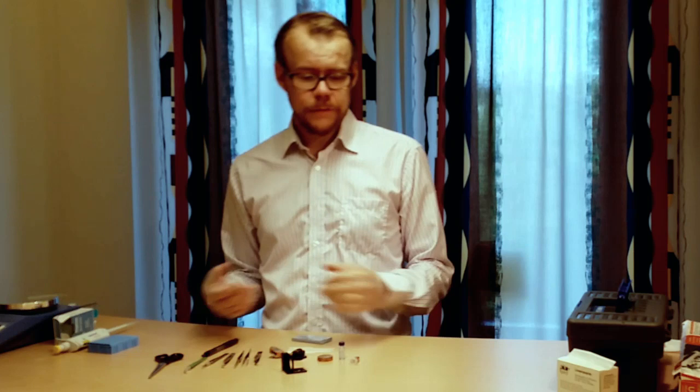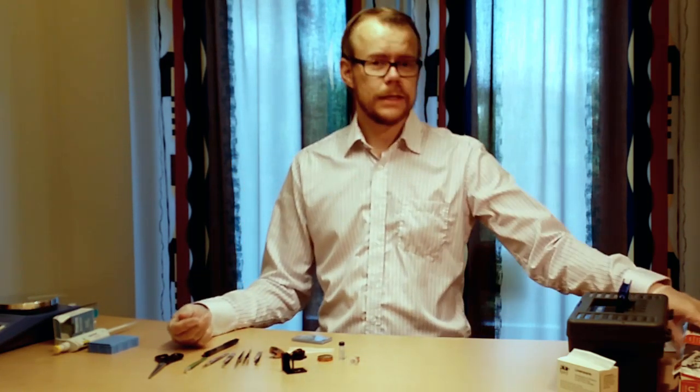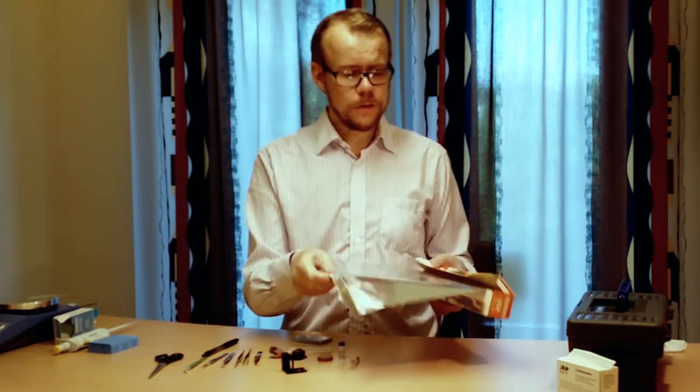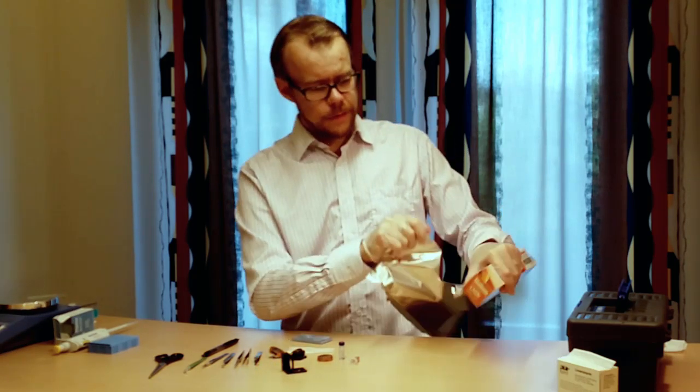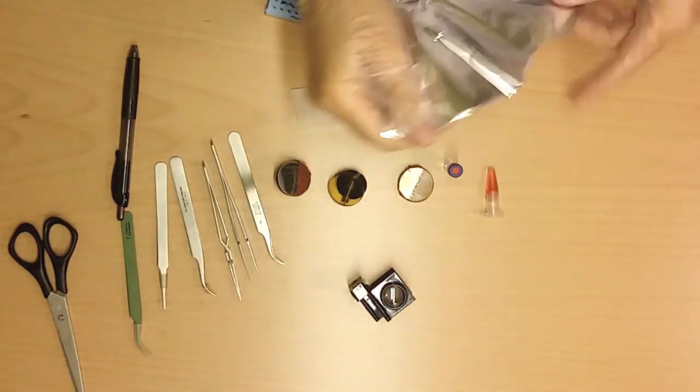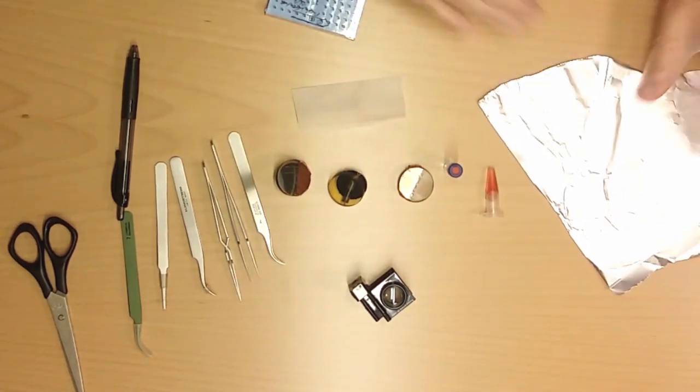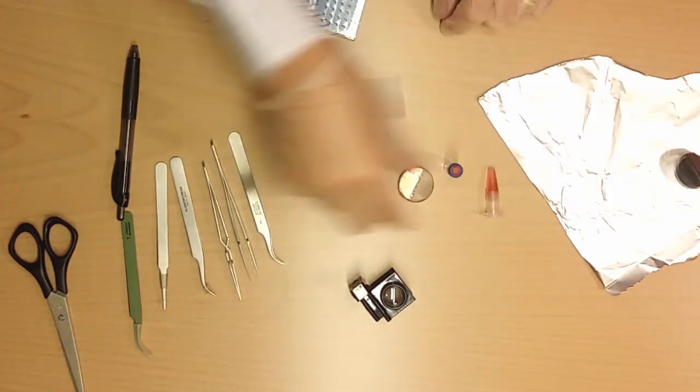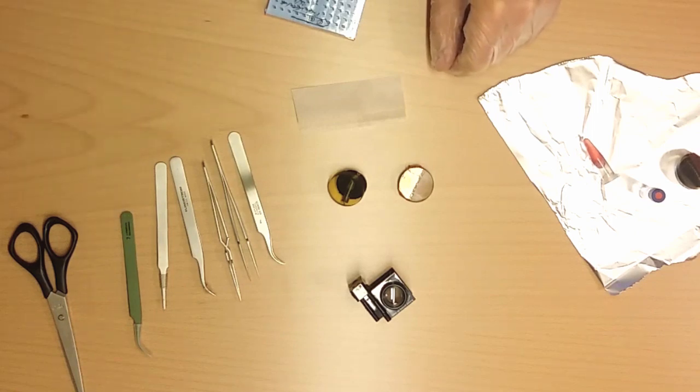When you do work with your samples it is very nice to have a very clean space. And one way to make a clean space is to use just standard aluminum foil like this. This you can buy at a grocery store. If you put these on top of your bench, then you have a very nice surface to work on here. Here you can have your samples when you do your sample preparations.